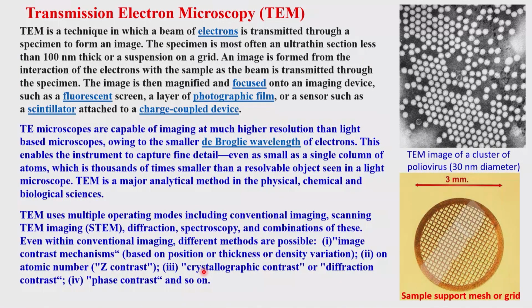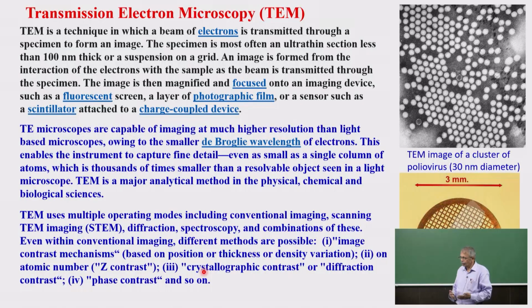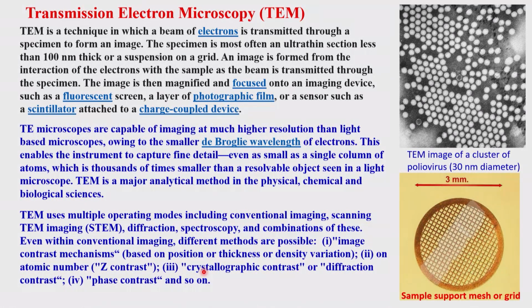So that art is very important. In crystallography, making the single crystal is an art. So when something is not shown in the microscopy, you cannot suddenly jump and say that this compound is not suitable for microscopy purposes. That is not correct. You have to see various parameters: how you made it, what the thickness is, all those kinds of aspects. So you need to make a very ultra thin sample and then use that.